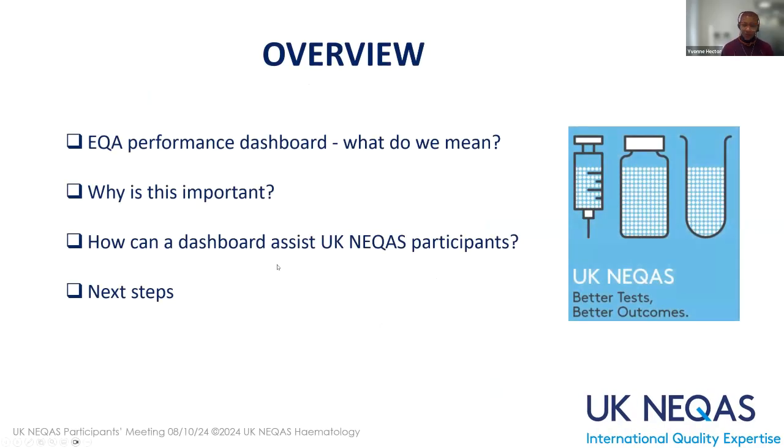We're going to look at the EQA performance dashboard and what it means. We're going to look at why it's important, and also how this dashboard can assist UK NEQAS participants in reviewing your performance, and also the next steps that we have planned for our dashboard.